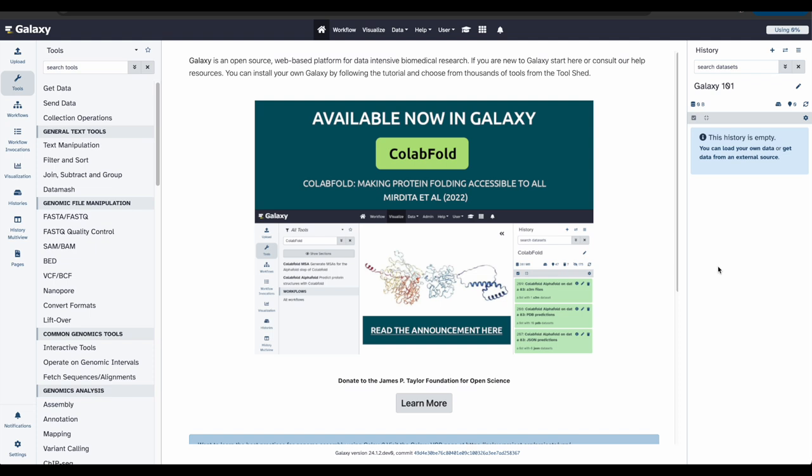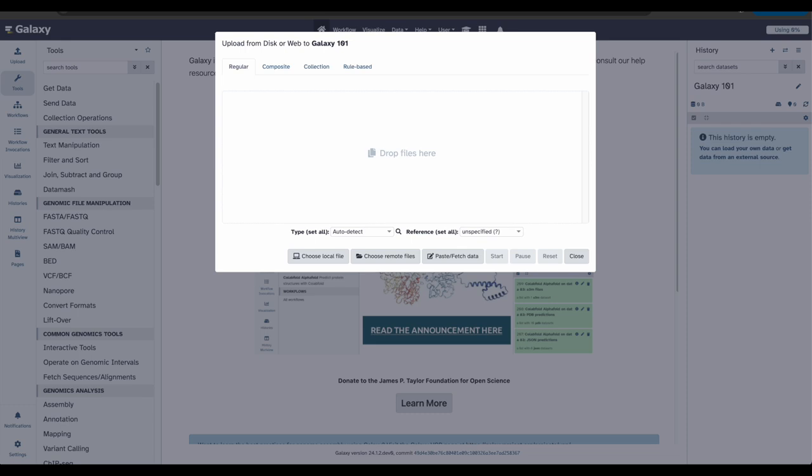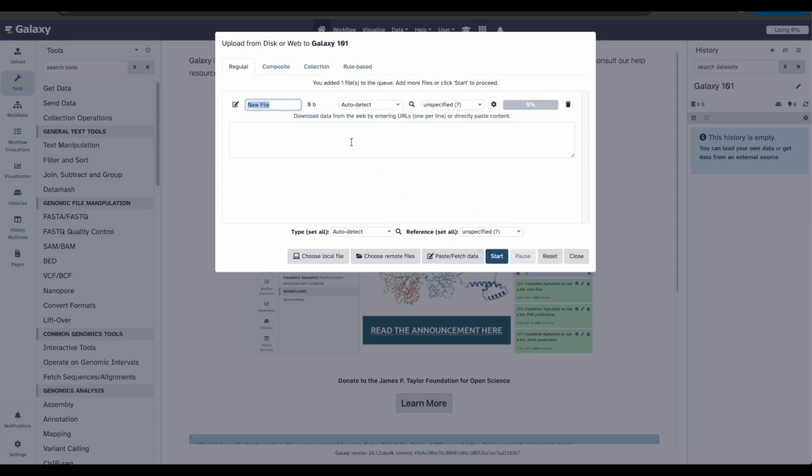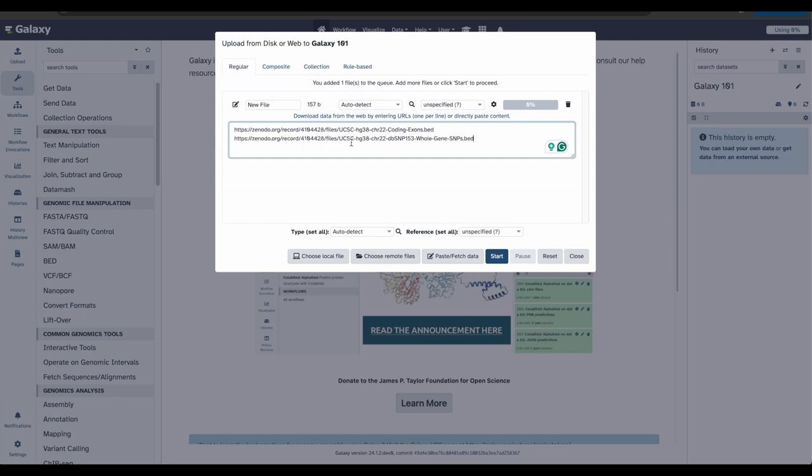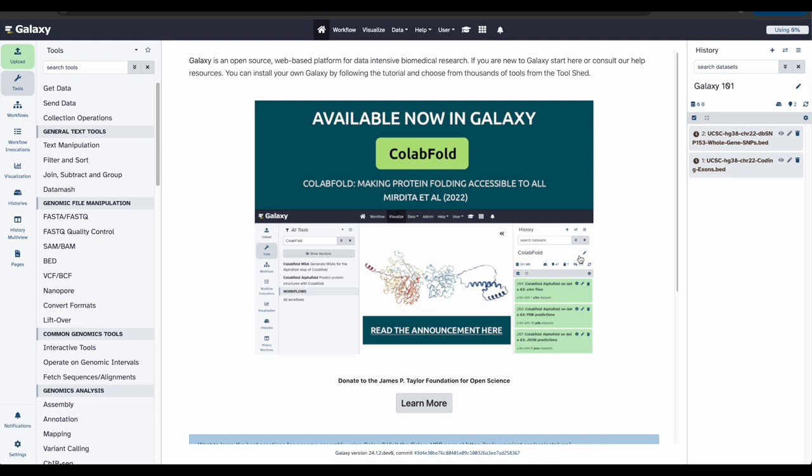Now, we need to add some data into our history so that we can begin our analysis and start answering our question. You can upload files from your computer, or Galaxy can also fetch data directly from external sources. For our first time, we're going to paste and fetch our data. To begin, click the upload in the activity bar on the left. Click paste and fetch. And then copy and paste the data provided in the tutorial on the Galaxy Training Network. It should look something like this. Then click start and close.